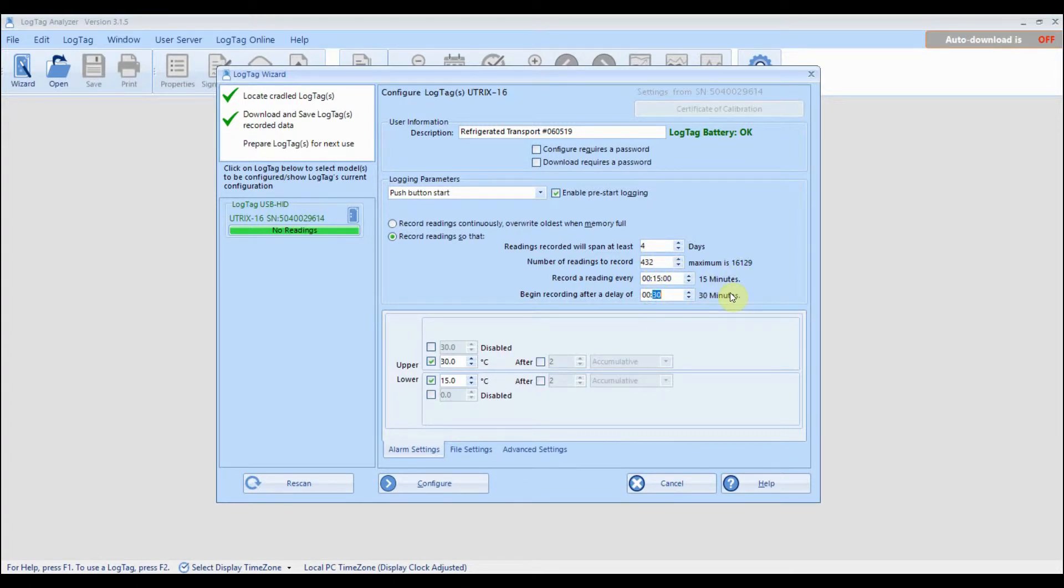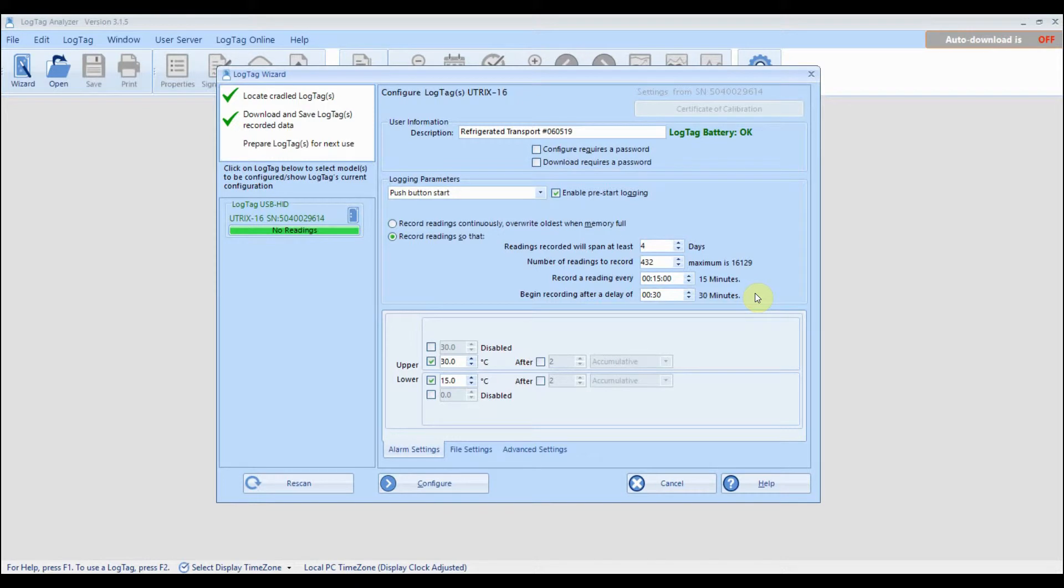Finally, you can enter in a start delay. Adding a start delay prevents false alarms by allowing your logger to adjust to the refrigerator or freezer temperature before recording starts.